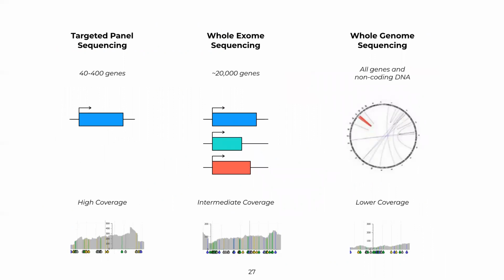The data for whole exome sequencing is prepared using two approaches, the first of which is array-based, and the second is in solution. For array-based capture, microarrays capture single-stranded oligonucleotides with sequences from the human genome to tile the region of interest fixed to the surface.